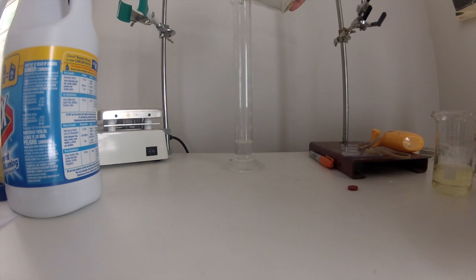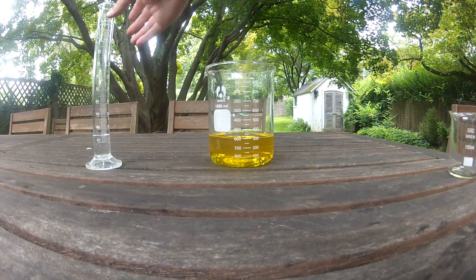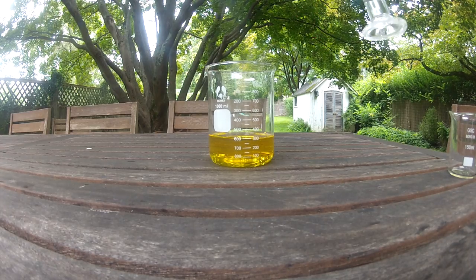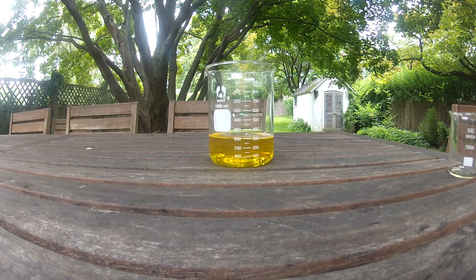Measure out 10 milliliters of water and add to that 4 milliliters of acetone. Then add the acetone water solution to the hypochlorite bromide solution. This will produce bromoform.